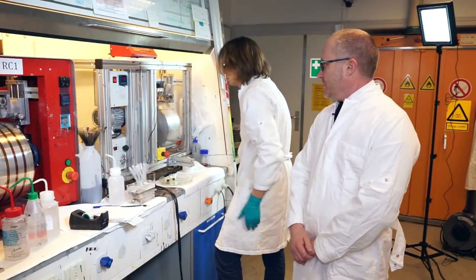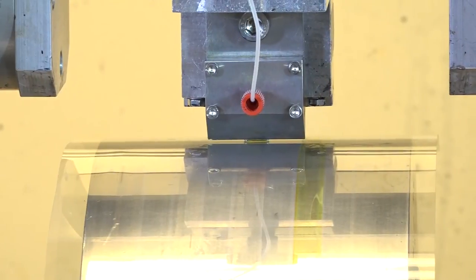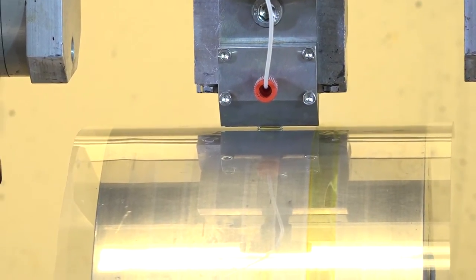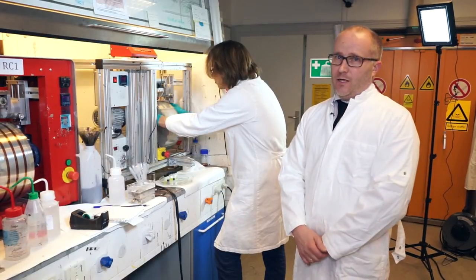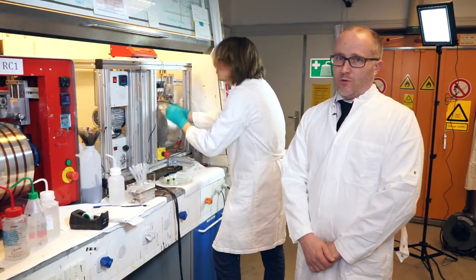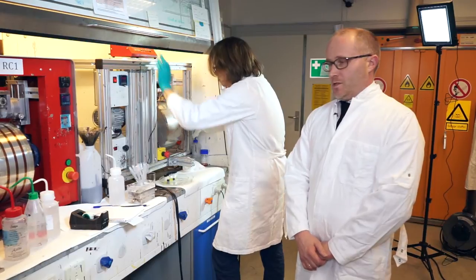What you're seeing here is a two-phase slot die coating lead iodide layer. This is the two-layer approach where you first apply the lead halide and afterwards the methyl ammonium iodide, and then you subsequently grow the perovskite layer over time.